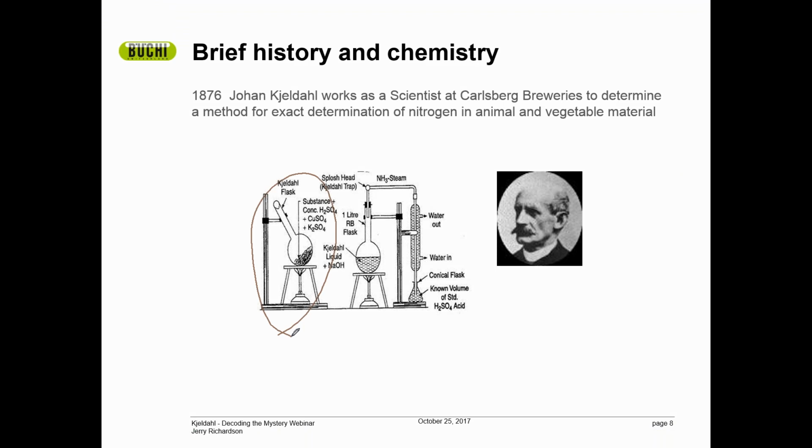Principally what you have is a concentrated acid with some salts that help to hold the sample, the nitrogen, in place while we transfer it and get ready for the distillation portion, which is through here.